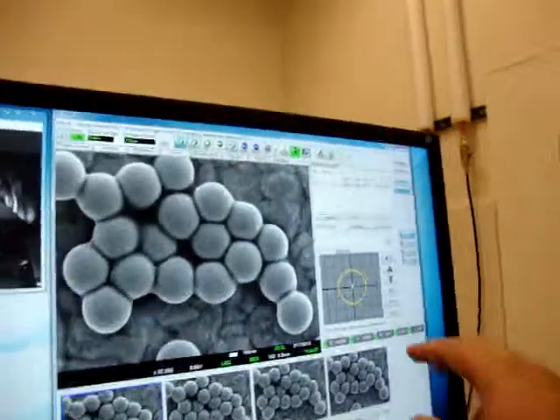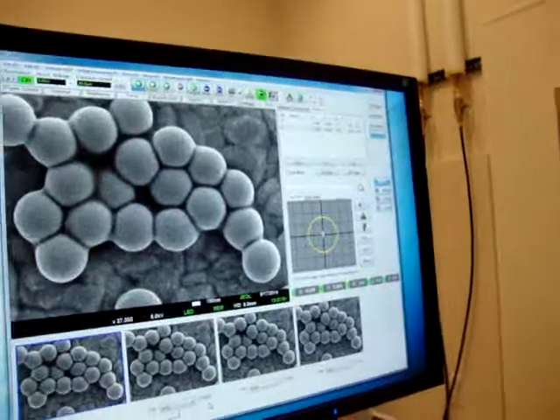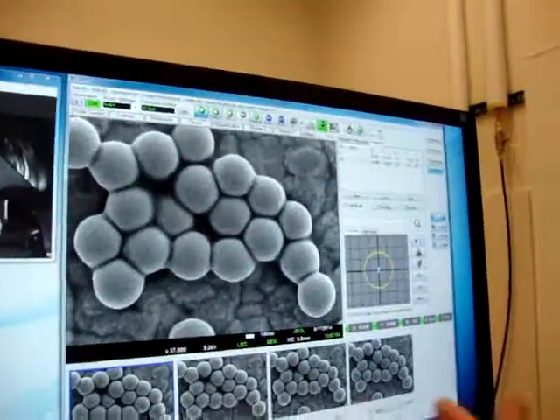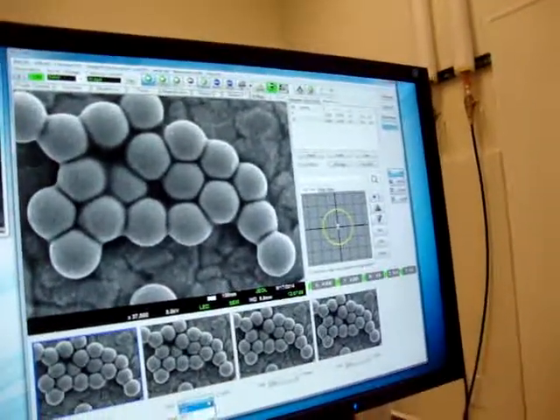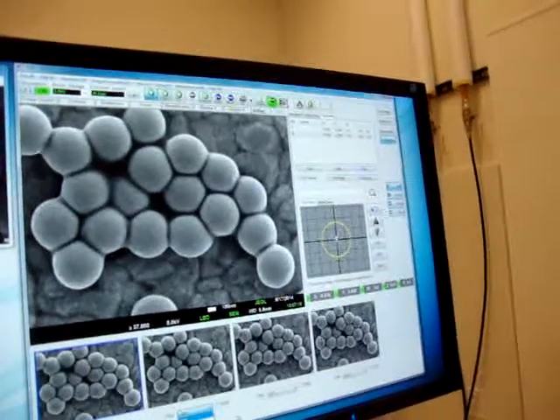In the comparison setting, you get these four different channels. Now, the four there are BEDT, BEDC, LED.